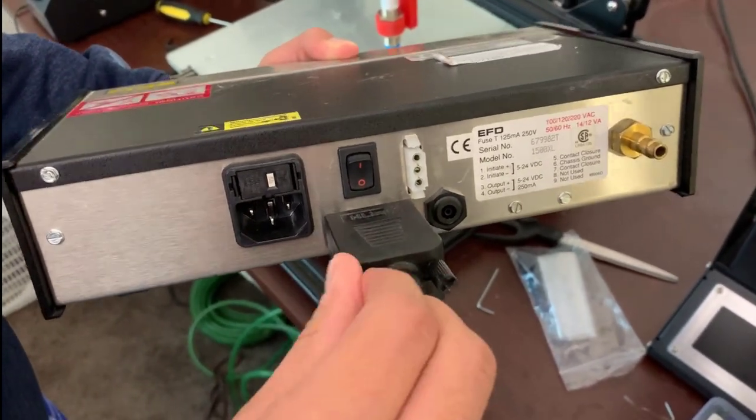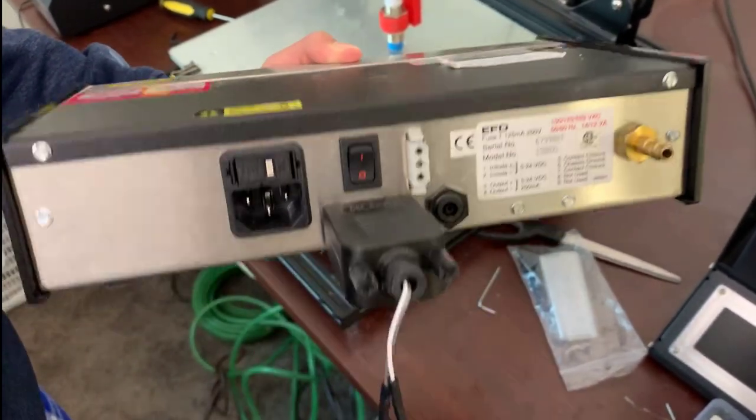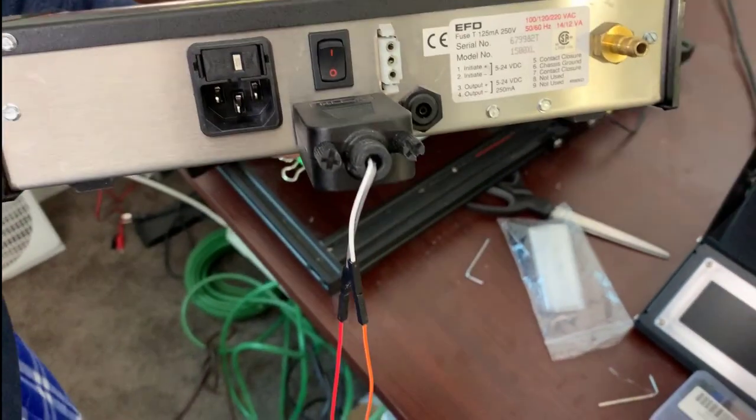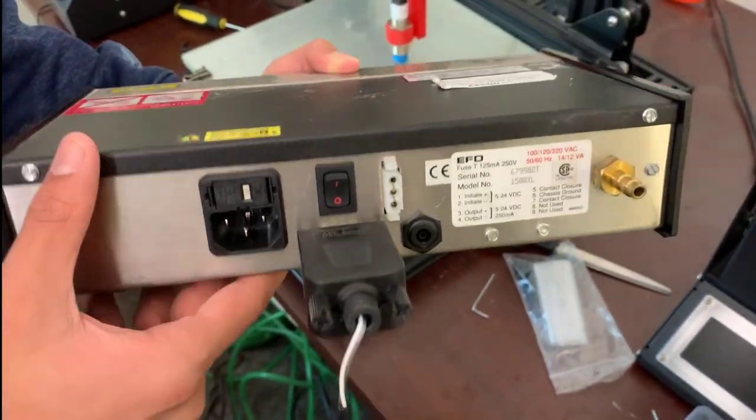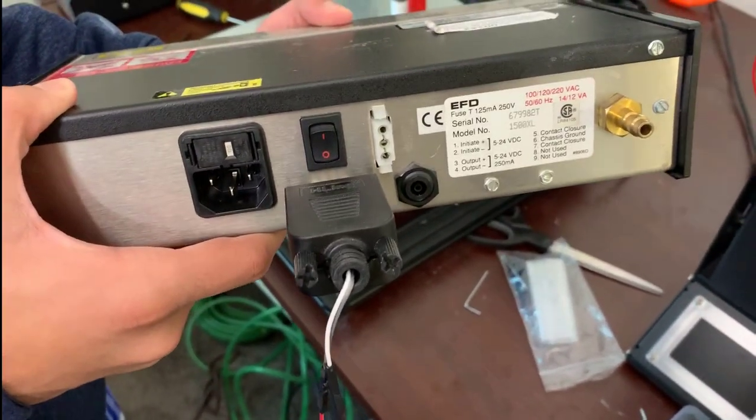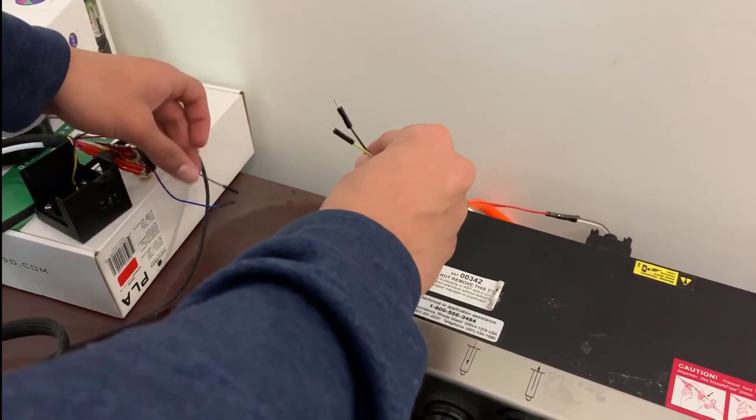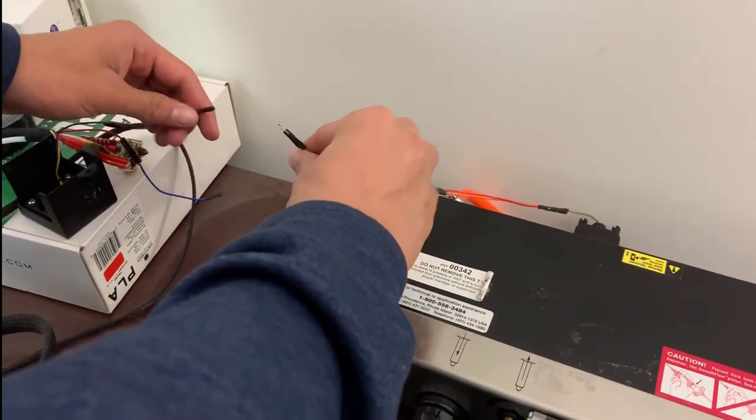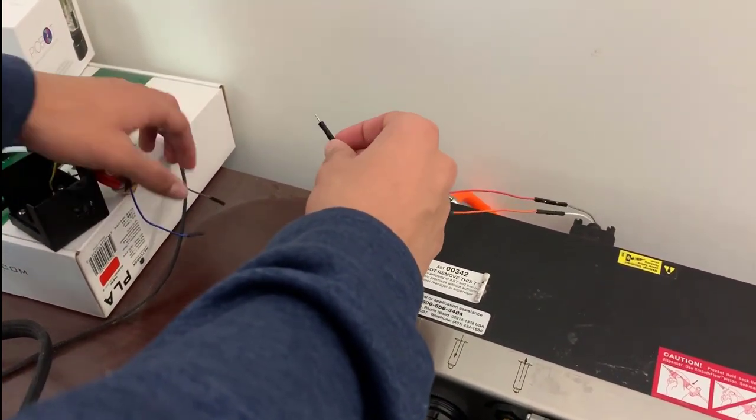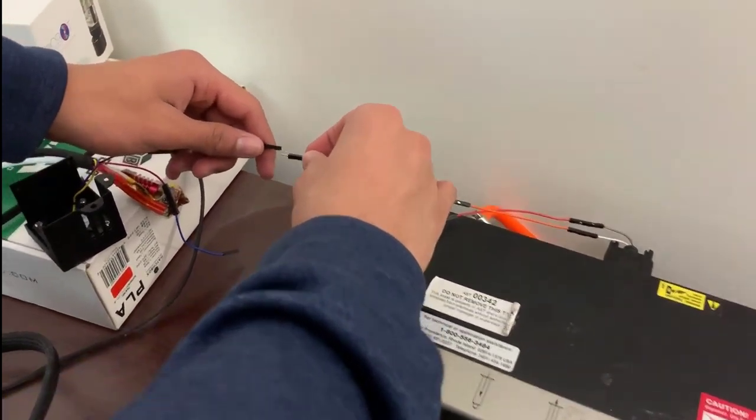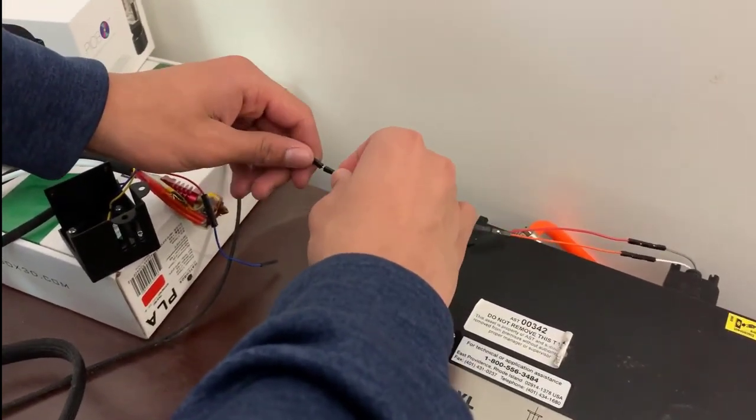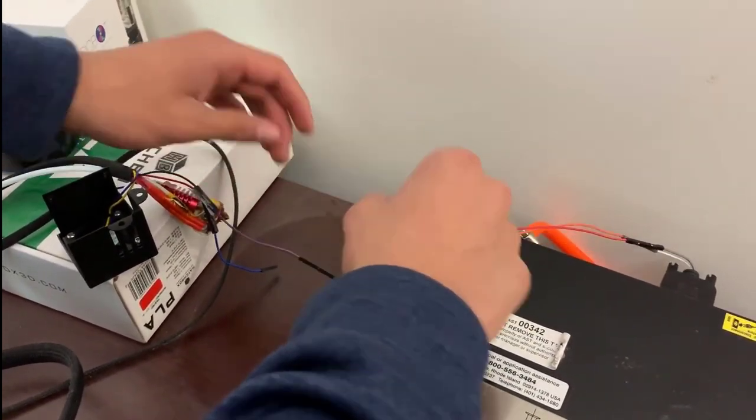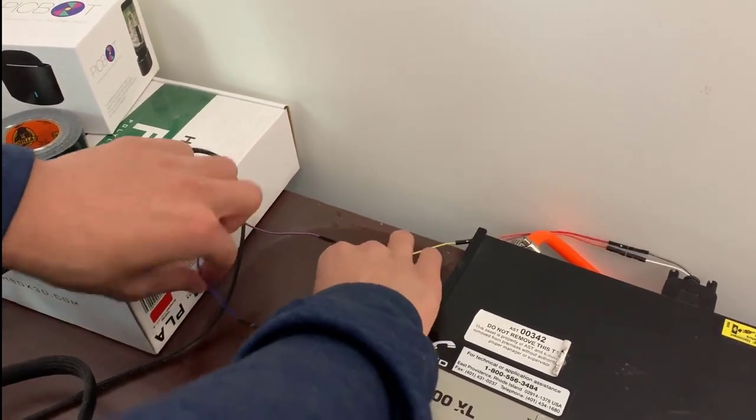And now all the connection wires are hooked up and all that's left is to connect this to the actual 3D printer. So to finish setting up our EFD dispenser, we're going to be connecting the fan motor leads to the leads that we just made from the EFD dispenser port.